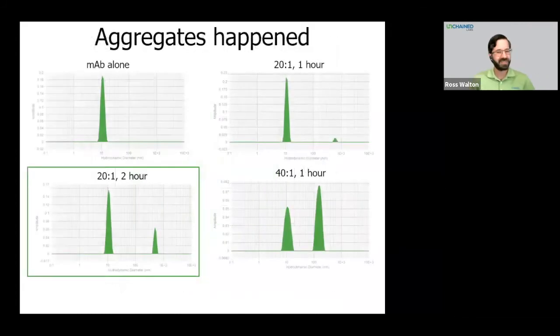But there's more we can actually look at. Looking at UV-Vis alone doesn't really give you the complete picture of what's been going on with these samples. So Stunner DLS gives us information on the colloidal stability of the samples after labeling. By comparing the intensity distributions of the samples, we can see all 3 reaction conditions, here, here, and here, caused some small amount of aggregation, a peak up here in that 100 to 1000 nanometer range. However, this 40-to-1 reaction condition caused, obviously, the most aggregation.